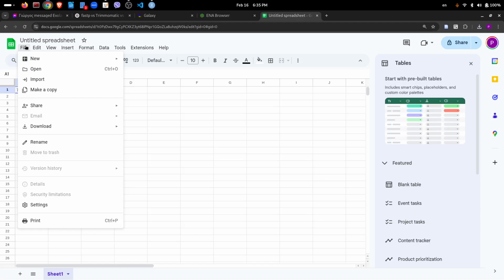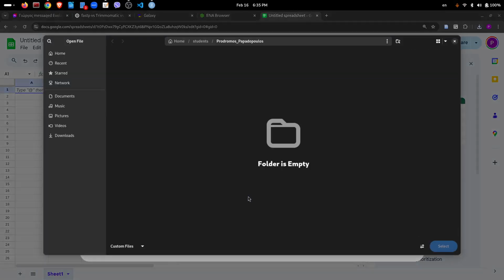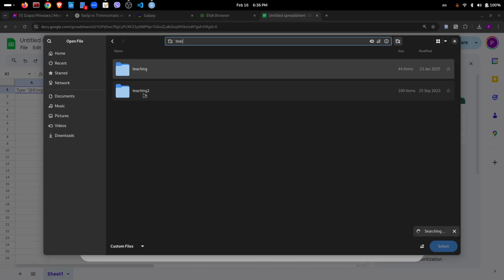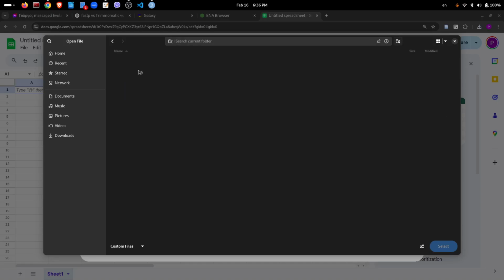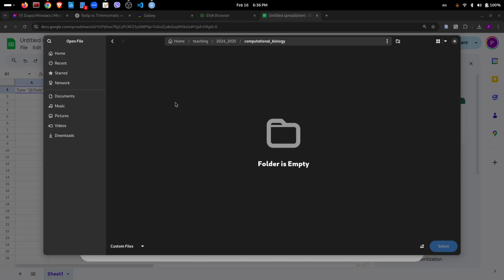So file, open, upload, browse, and then we go to home. I'm just looking for the place where I saved the table.